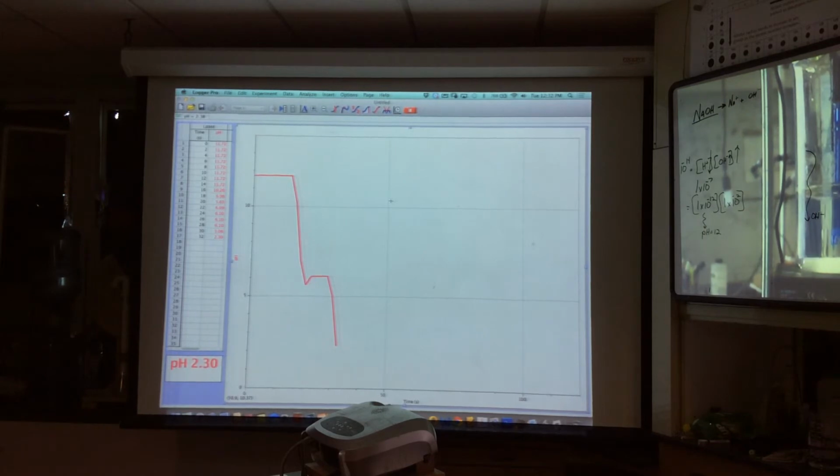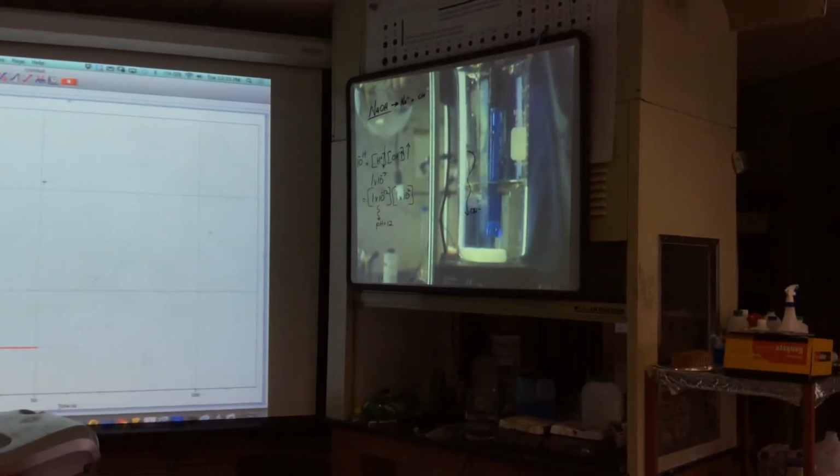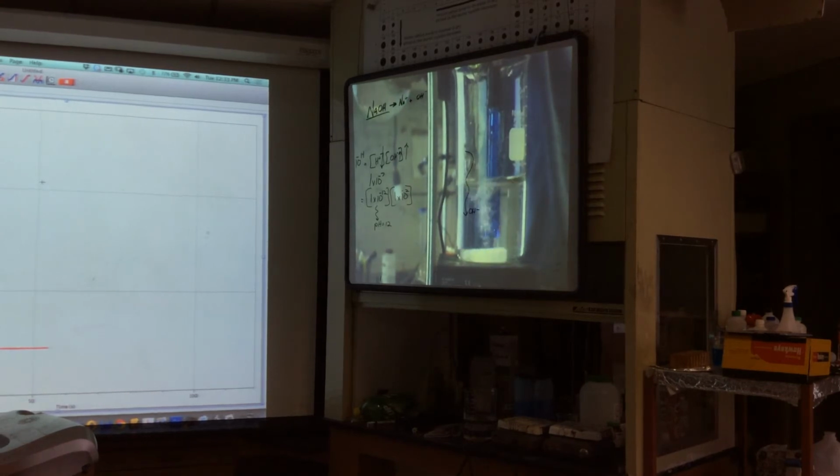What happened to my phenolphthalein? It went clear. Phenolphthalein turns pink in the presence of a basic solution, that's what, above 7 or below 7? Above 7. But I could add more what? Base to bring back the color. So as I bring it back, watch the color. You see it kind of disappearing? I'm pouring, you see the pink and it's disappearing.